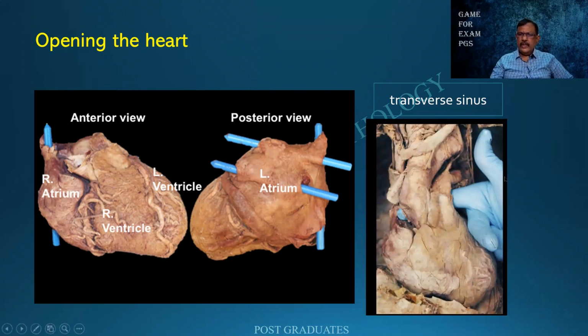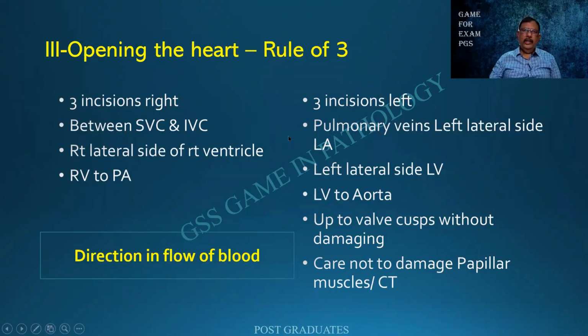And this is a transverse sinus. Look at the dissector. He has put in a digit of his. There is a plane of separation between the great vessels and what is behind. This will have to be taken into account. Also, people used to ask, where are the coronary ostia? Immediately after the aorta comes out, the first group of openings will be the coronary ostia, from which we will be getting the coronary arteries. Sometimes it is described as the sinus of Valsalva. In the next few slides, I shall be showing you magical pictures of opening the heart.